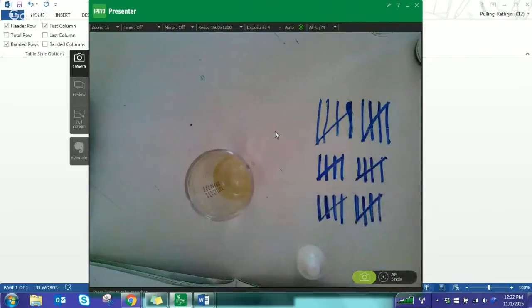I'm going to give it a couple more. If I don't get red, I'm going to test the pH just to make sure there's not a mistake in the lab manual about what color it should change.